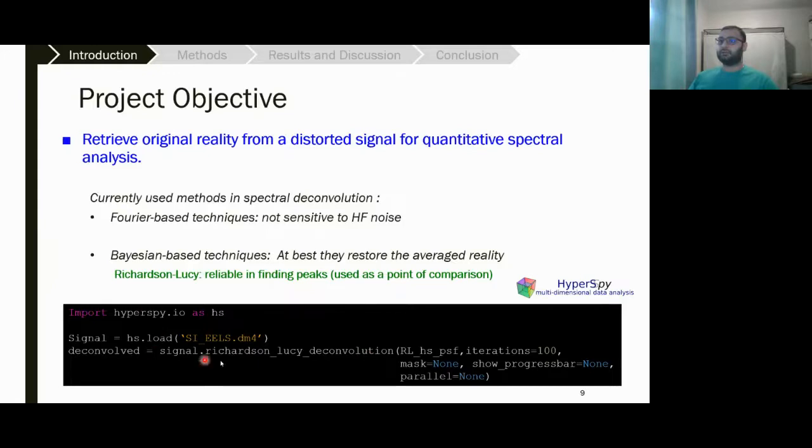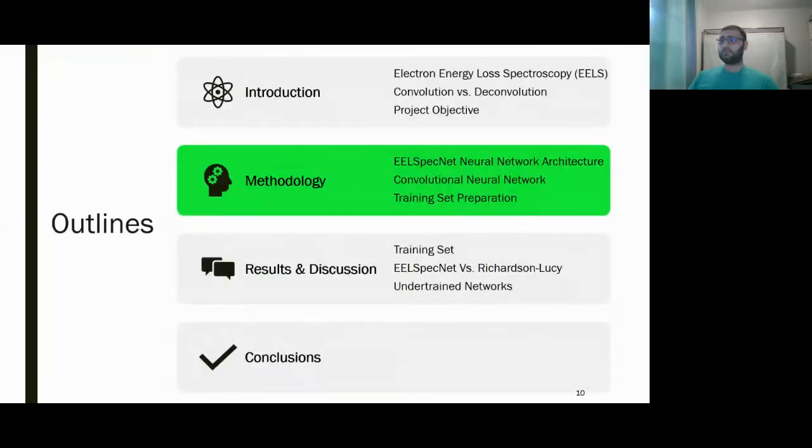In here, we use Richardson-Lucy to compare the data we obtained from EELSpecNet and see how EELSpecNet performed with respect to the method currently used in the community. For applying Richardson-Lucy, we use a HyperSpy Python toolbox. You can see it is very simple, one line of code.